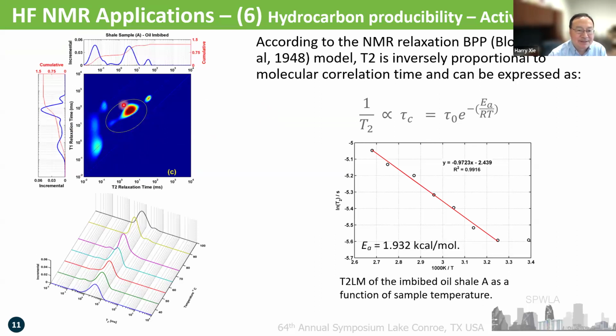And then if we just focus on this region, so we circle this region, and because there's no water, the oil is just the hydrocarbon. So we don't have to do the 2D measurement. We can just use the T2 to analyze, because the T2 is the measure of the molecule mobility. Okay, so we circle this and we just plot the T2.